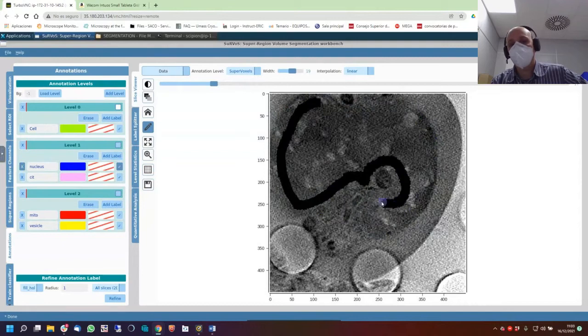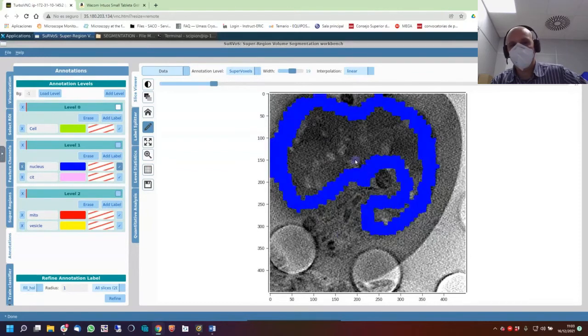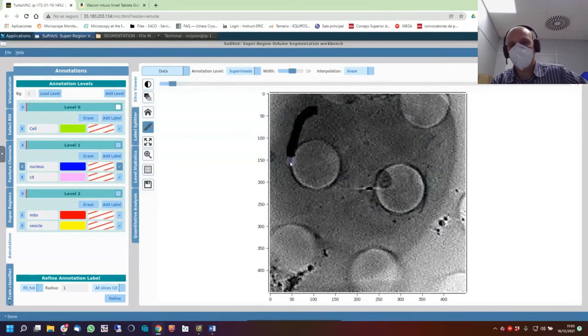And that's interpretation. That's why you need to know. It's not easy to try to segment some volume that you don't know, because you need to put your knowledge inside. The nucleus should be here. You see the shadow, and the shadow here. Fine. You see.